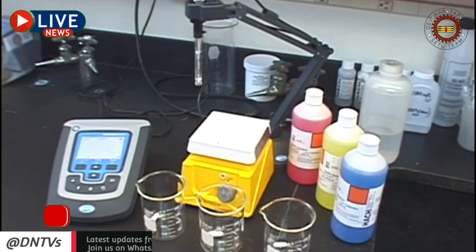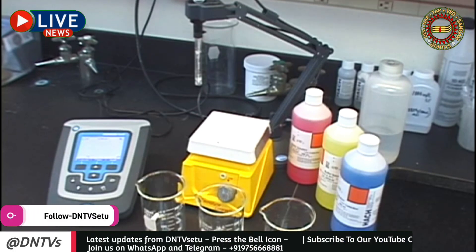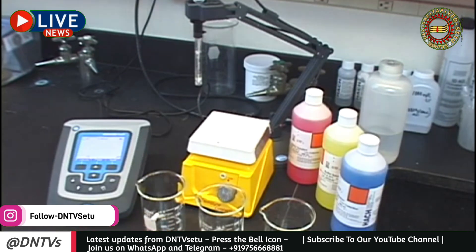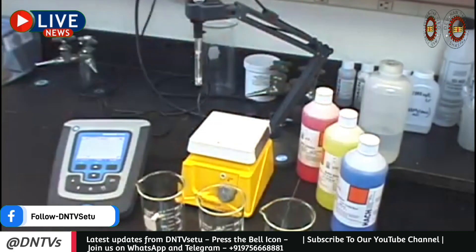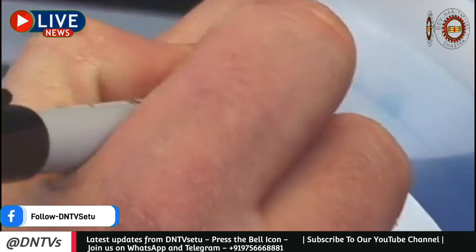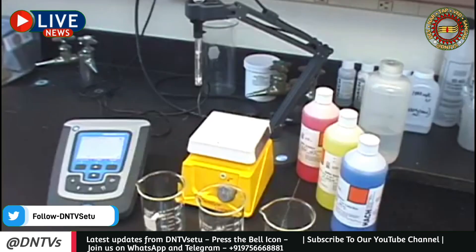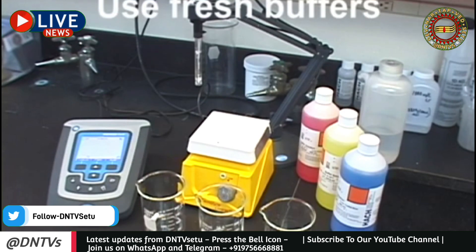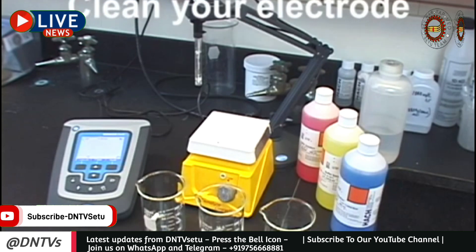There are some key things to consider before you even calibrate. Keep in mind that everything you do from this point forward is dependent on how well your meter is calibrated. First, make sure the beakers you're using are clean — this helps ensure you're not mixing different standards in a single beaker. Next, check the expiration date on your pH buffers. Once opened, the 4 and 7 buffers are typically stable for several months, while the 10 buffer can drift in as little as one month, due to absorbing carbon dioxide from the environment. Always use fresh buffers every time, as reusing buffers may cause your meter to calibrate incorrectly, resulting in inaccurate measurements. It is also critical to clean your electrode before calibrating to avoid contamination.